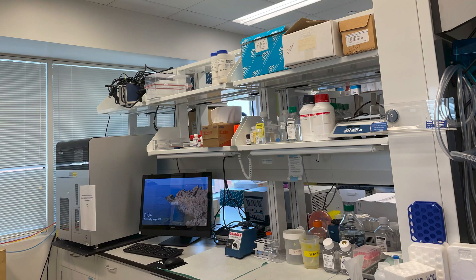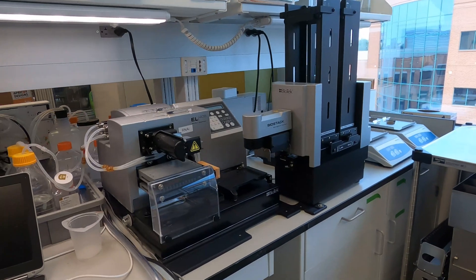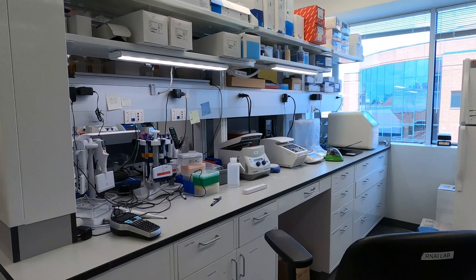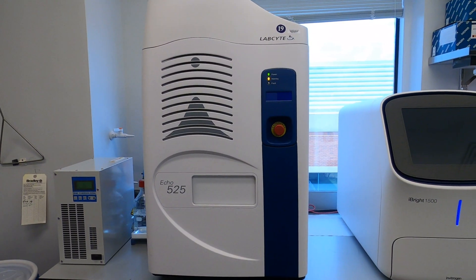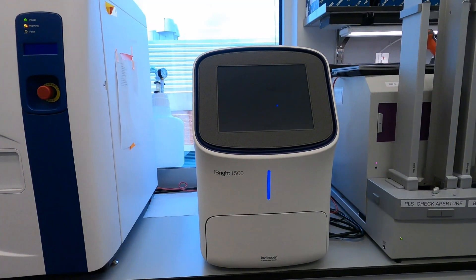This is the wet lab. Here we have lab space for liquid dispensers as well as washers. The plate washers allow us to wash the plates for image-based analysis. We have a bacterial station where we do bacterial work for cloning and subcloning, a PCR area where we do quantitative PCR. We have a Sony cell sorter to sort cells based on color and size, an Echo acoustic dispenser which uses sound to dispense volumes, and lastly an iBright, which is an automated western blot system. That covers our wet lab space.